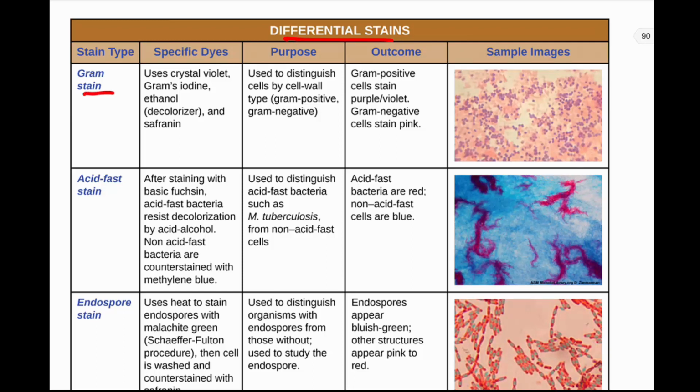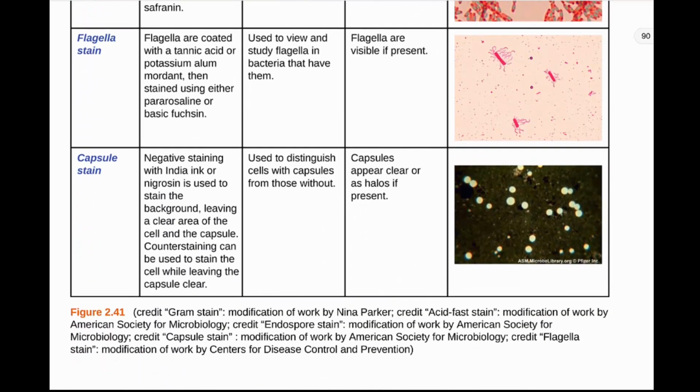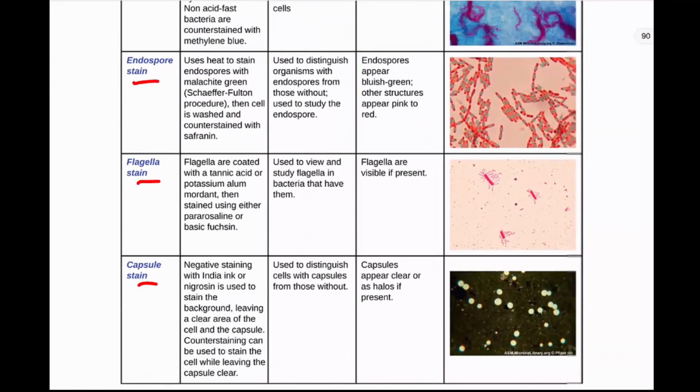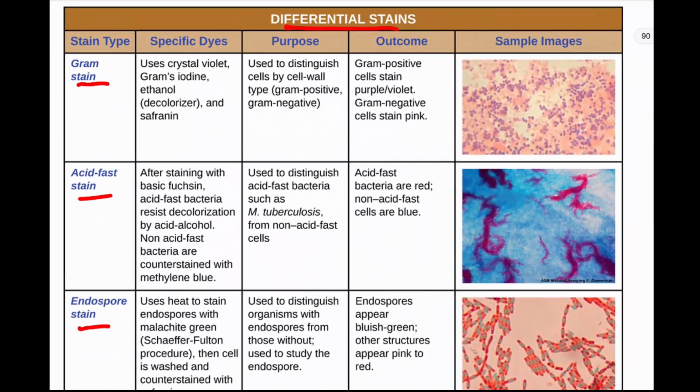So we talked about the gram stain, acid-fast stain, endospore stain. We talked about the flagella stain, and we talked about the capsule stain. So you should know all of this information. This is a nice little chart you can use perhaps to study, to know the stain type, the specific dyes that are used, why it's used, the purpose, the outcome, what you get, and then you can see the sample images here.